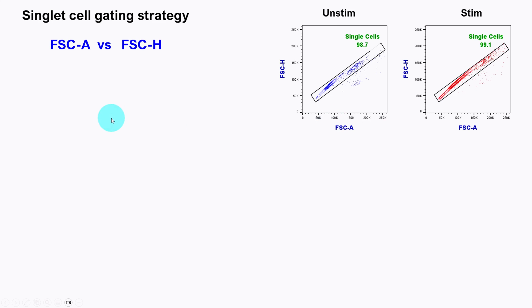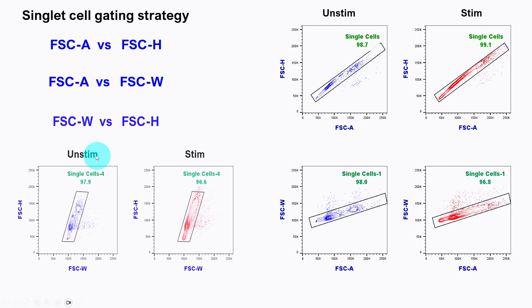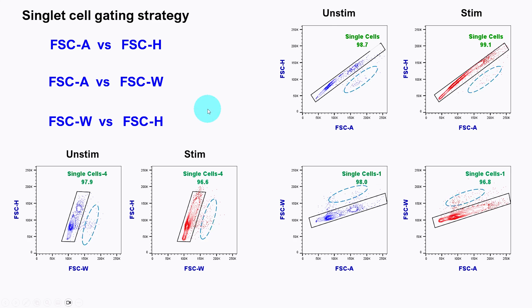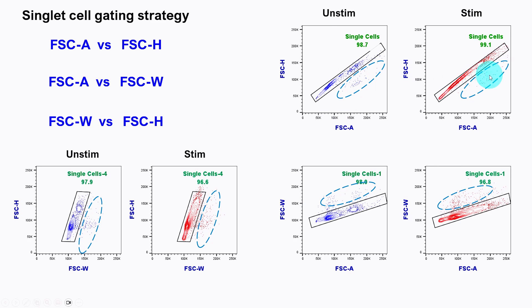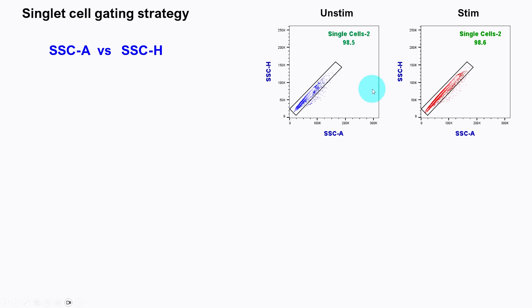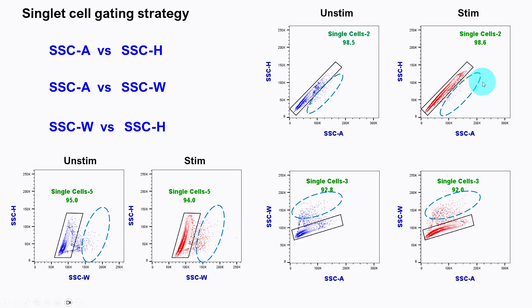You can also use FSC area versus FSC width, and FSC width versus FSC height, in both conditions. You can reverse these parameters — for example, FSC area versus FSC height or FSC height versus FSC area. Likewise, you can use the side scatter detector to discriminate singlets and doublets in a similar way, using SSC area versus height, area versus width, and width versus height. You can see the doublet cells in this strategy as well.